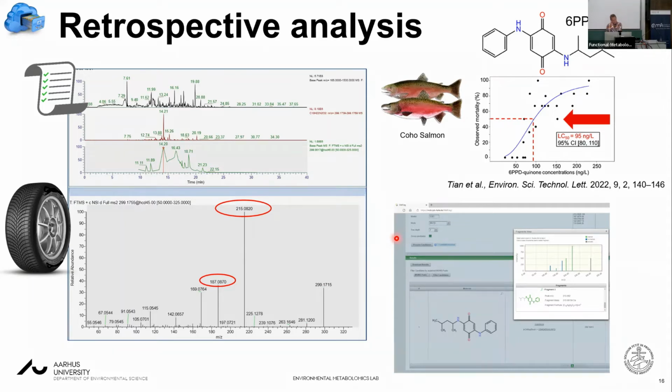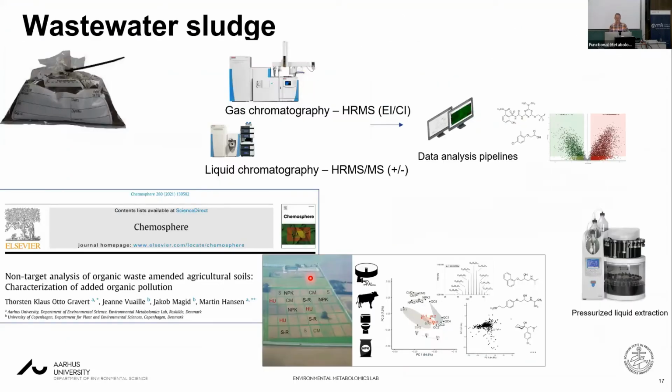In this case, it's MetFrag, and it matches with the fragments that we have. So we could say that this is a level 2 substance, and it's highly likely present in the sample, and we could quantify it. It was not around 95 nanograms per liter locally, so there's still trouts in the rivers.